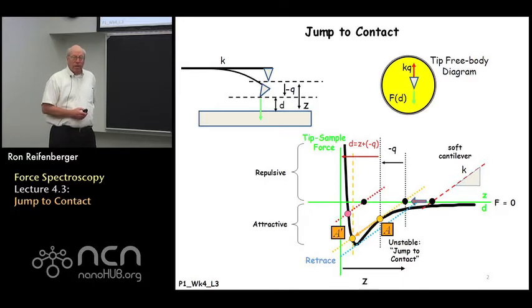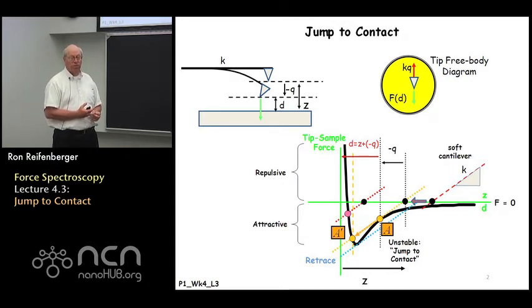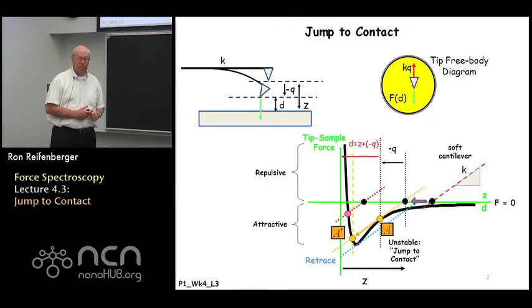So this is more of a slide to remind you of what we discussed in the last lecture. It's important to understand the processes involved in constructing this slide, and in particular, it's important for you to remember the sign conventions that we use when we discuss the deflection of the cantilever Q. So that little cartoon up there in the upper left is an important diagram that we'll use not only through this lecture, but through the next 2 or 3 lectures.